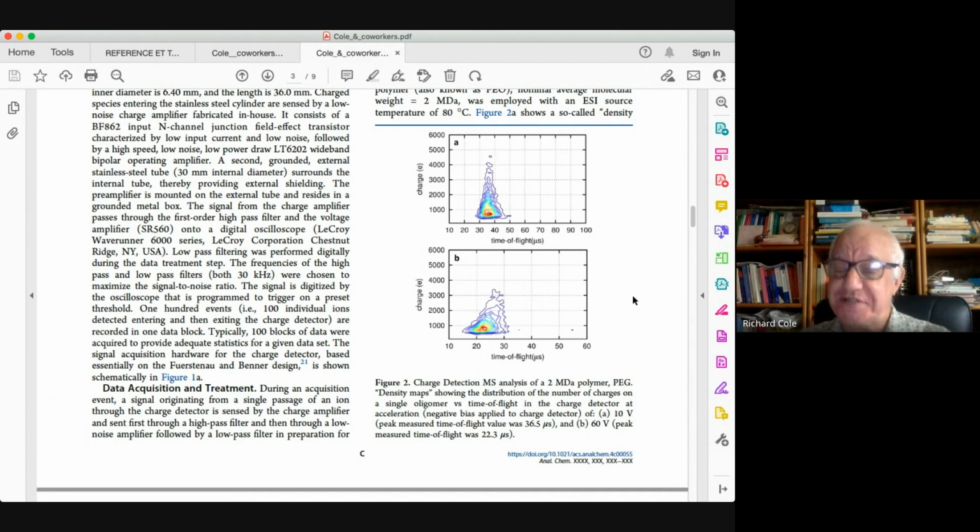I wish that was the case for us, but it's not. This is, as you saw, a home-built, lower cost instrument. That's its big advantage. But we don't have some of the advantages in terms of being able to know the initial energy of our particles. And that's going to cause difficulties when it comes time to convert and calculate our mass to charge values.